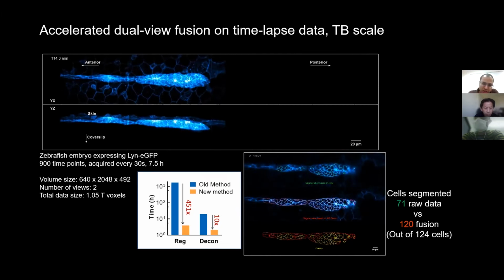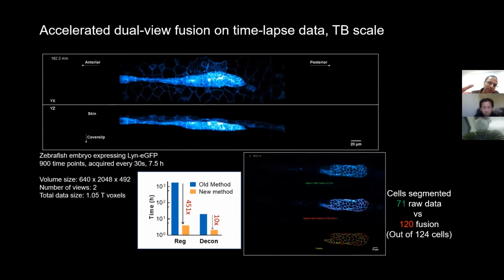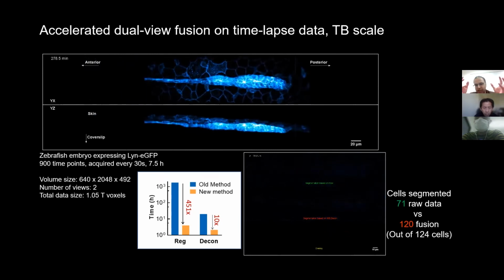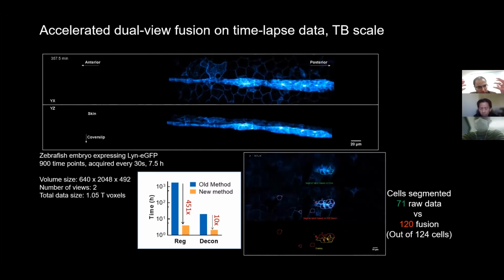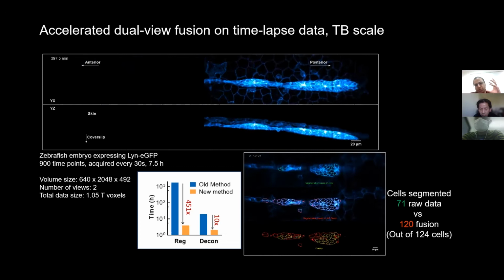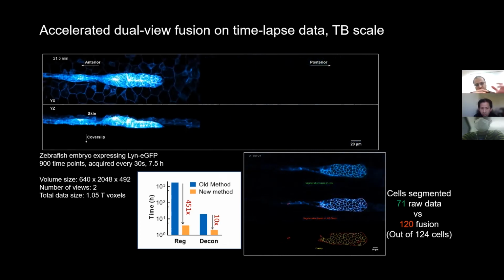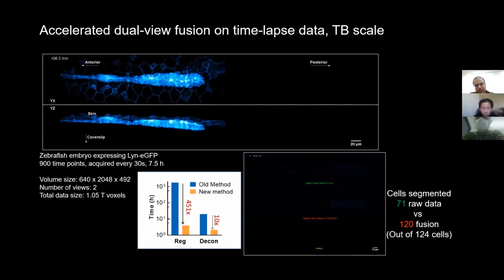And you could even imagine if you could further improve accuracy and speed of feeding back, right, and applying perturbations to the system with some pulsed laser or with some optogenetic perturbation. And so this ability to interact with the sample in real time, which we didn't quite hit here, I think is an important application which should motivate us to keep improving the speed of these post-processing methods.